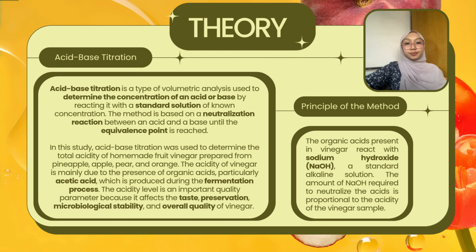The principle of the method: the organic acids present in vinegar react with sodium hydroxide, a standard alkaline solution. The amount of sodium hydroxide required to neutralize the acids is proportional to the acidity of the vinegar sample.